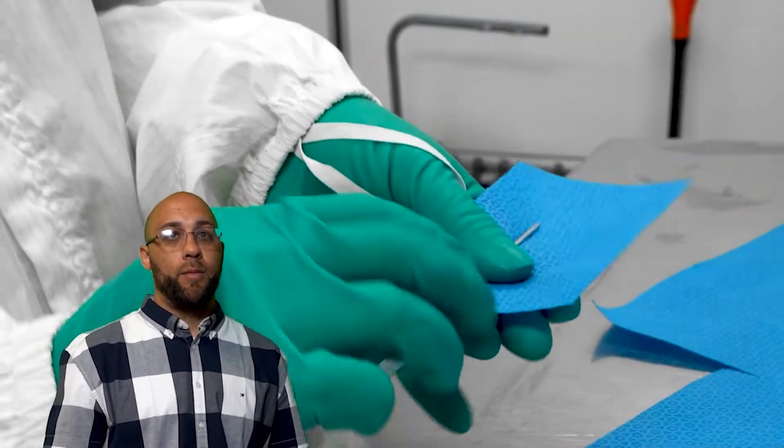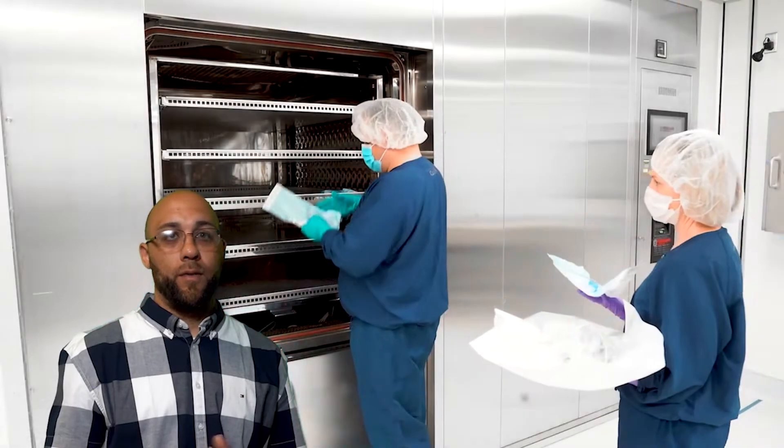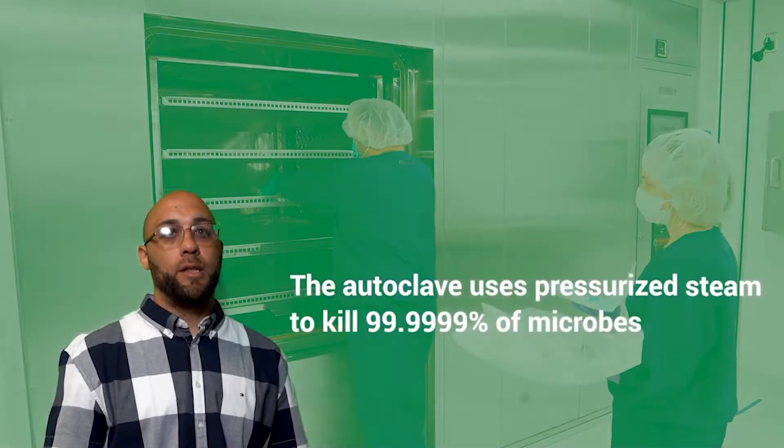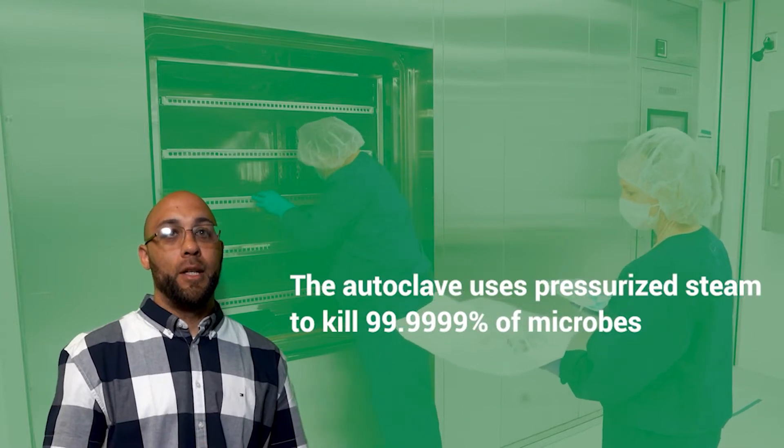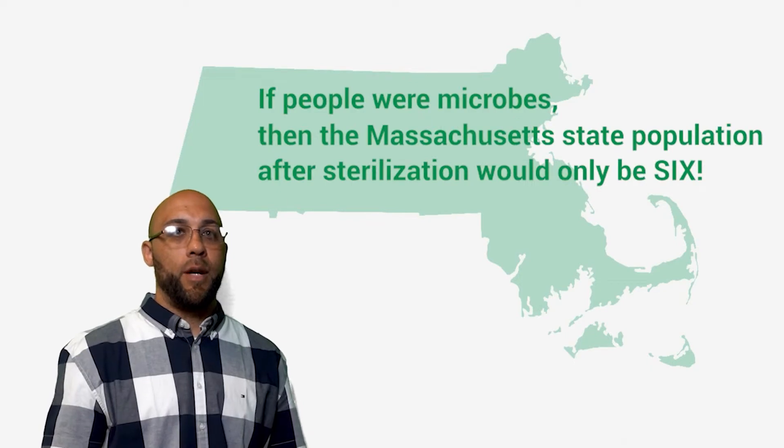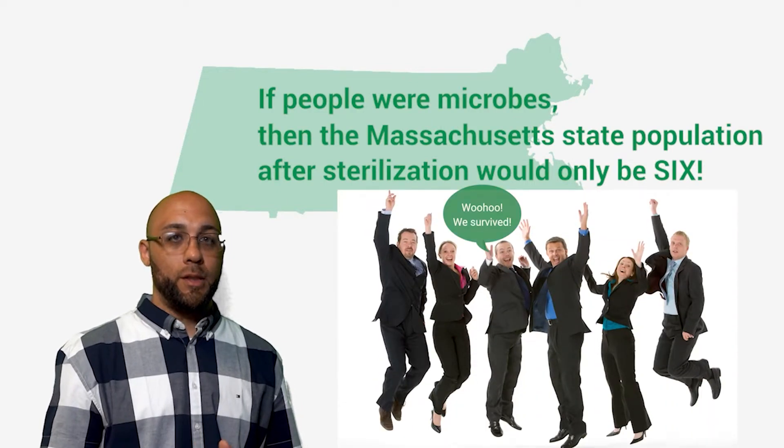In here, we wash, prepare tools and materials, wrap them in autoclave bags, and sterilize them in our autoclave. The autoclave will use pressurized steam to kill 99.9999% of all microbes. This means only one out of a million bacteria will survive. If people were microbes, then the Massachusetts population after sterilization would be six.